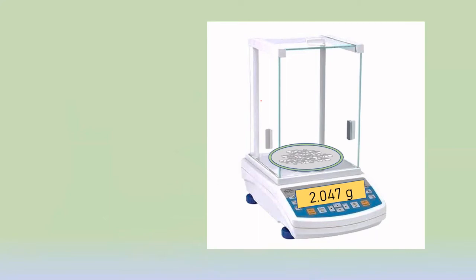This is 2.047 gram. This is my watch glass plus the product, together showing a reading of 2.047. So the empty watch glass, we have noted the mass of that, it was 1.304 gram. And now I have this watch glass along with my compound, it is weighing 2.047. You can calculate this difference. I'm not going to give you the reading right now.